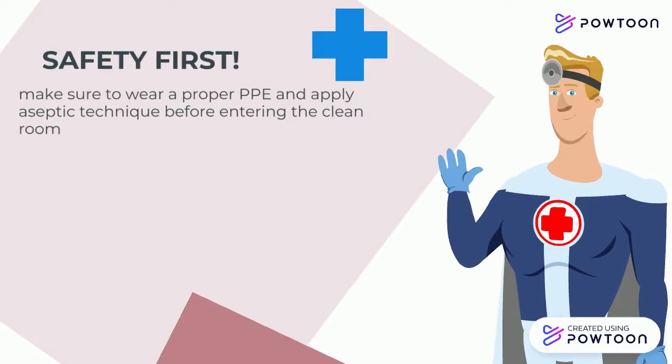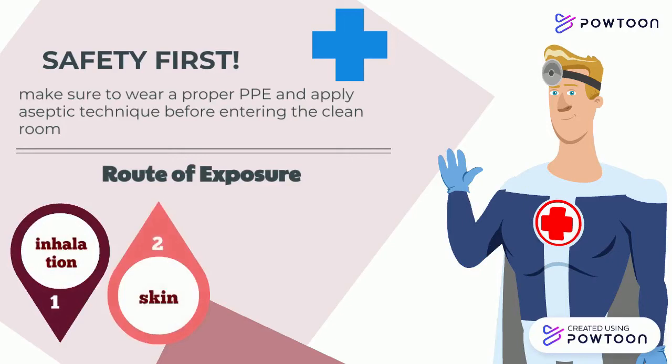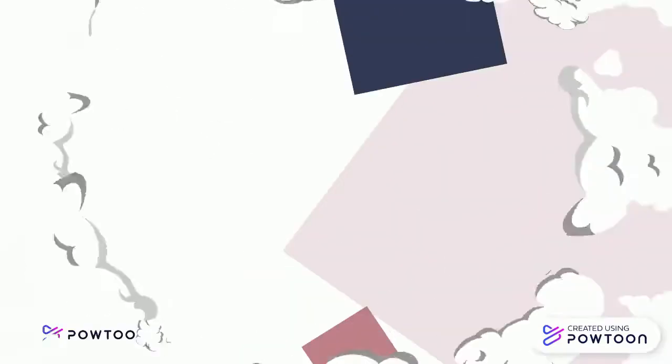Make sure to wear a proper PPE and apply aseptic technique before entering the clean room. There are 4 routes of exposure: inhalation, skin, needle prick injury, and accidental ingestion.